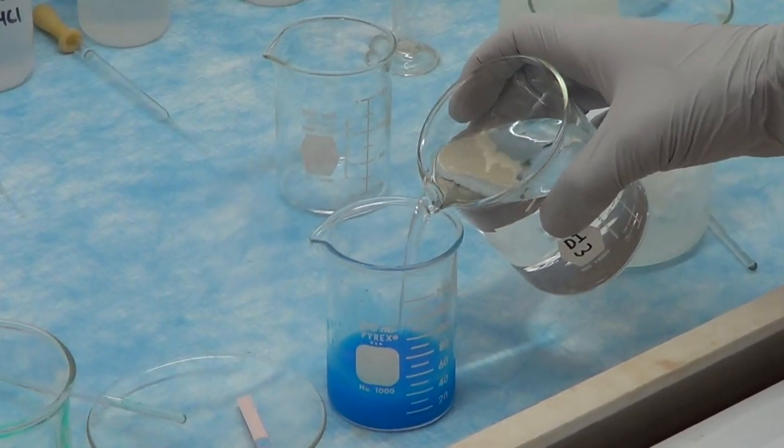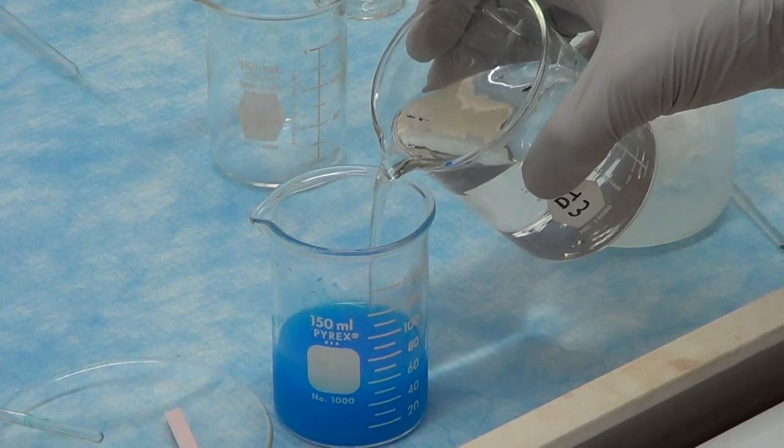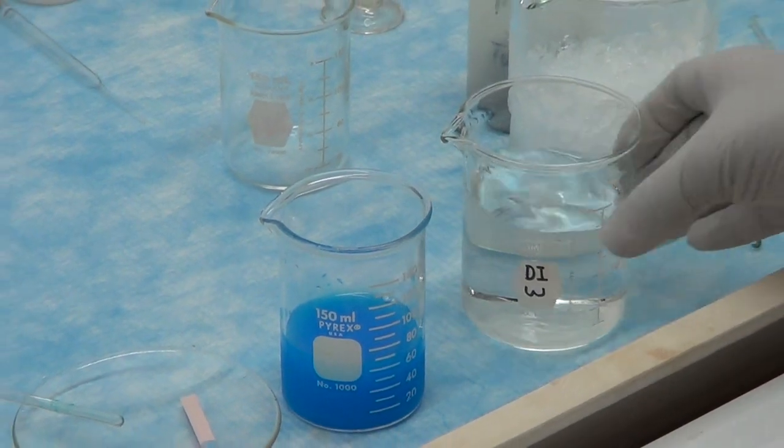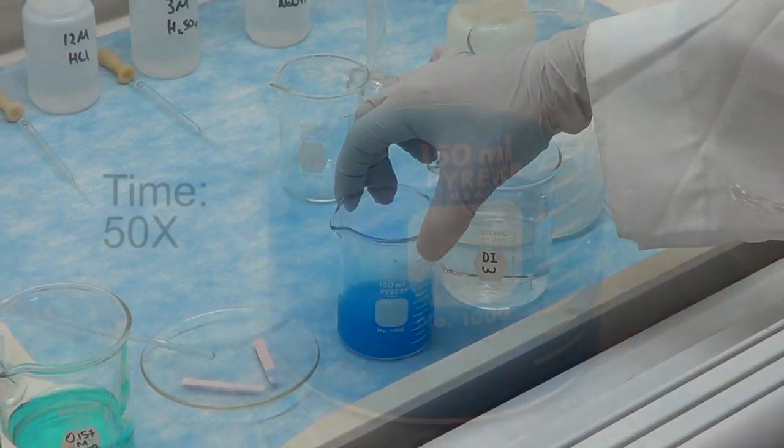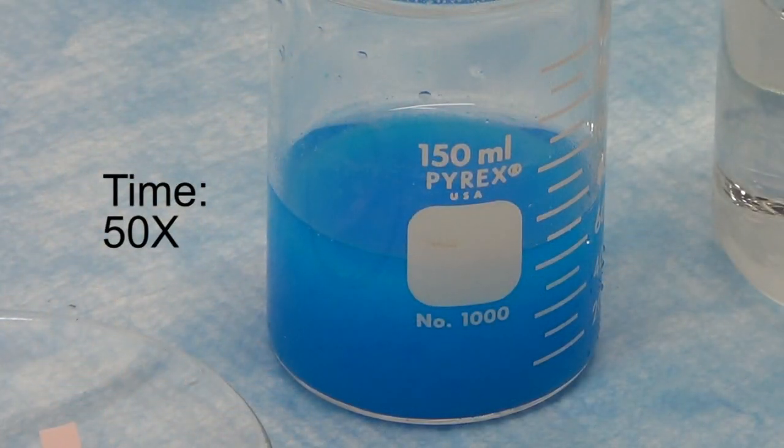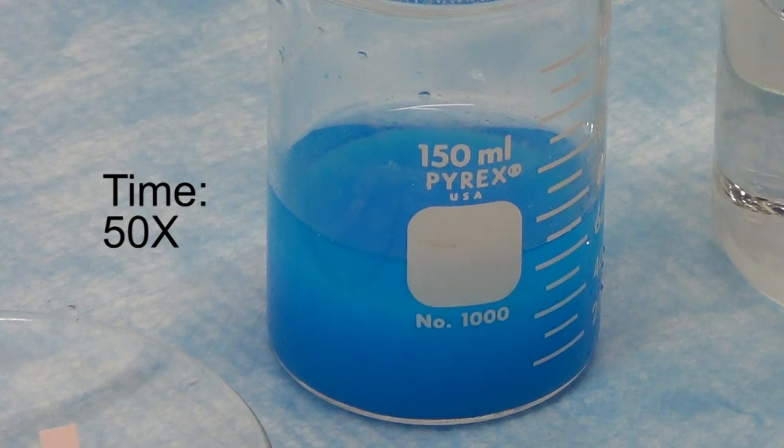Next we will wash the precipitate three times with 30 ml, 50 ml and again 50 ml of water. When we add the water to the beaker, we will stir the solution and allow the mixture to stand for few minutes while the precipitate settles.